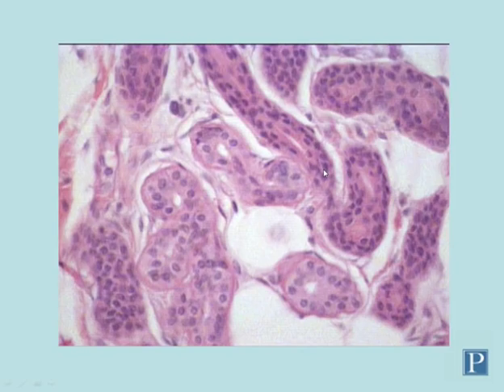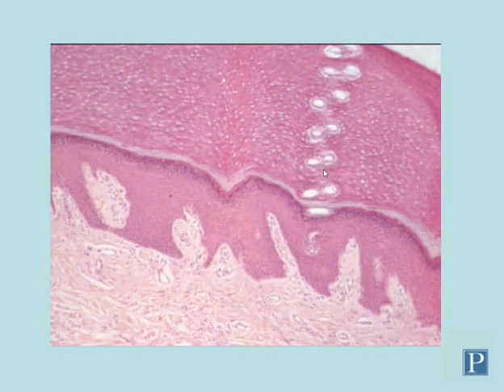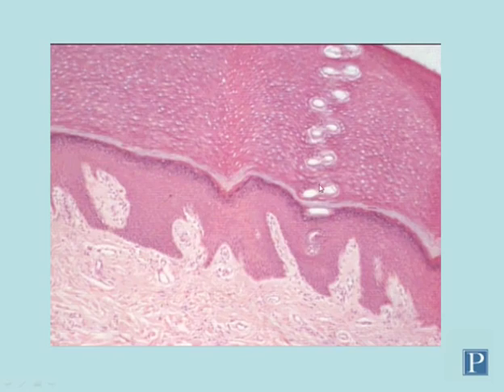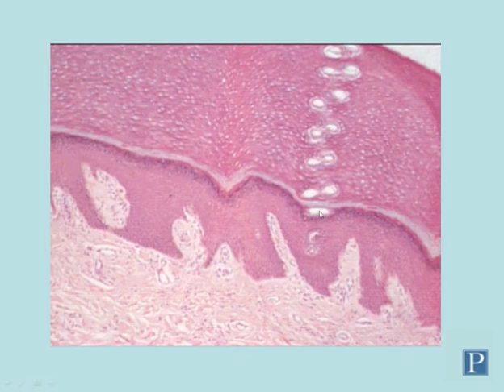Eccrine sweat glands can be found throughout the dermis and hypodermis. In some sections you may see holes through the epithelium — this is where the duct of the sweat gland coils through the epithelium to reach the surface. That's not an artifact but a real structure visible as the duct passes through.